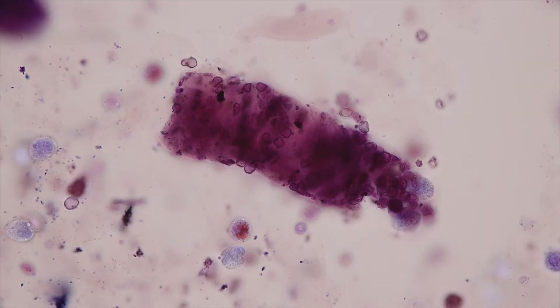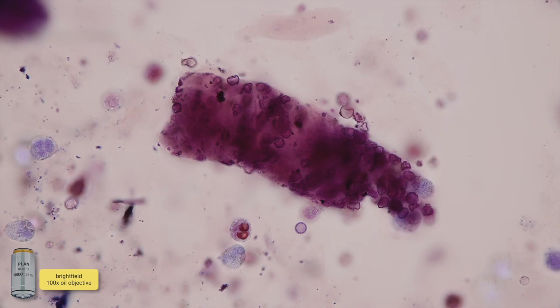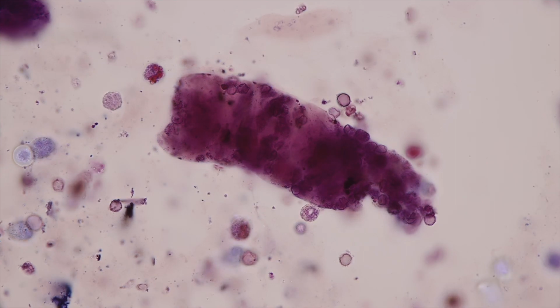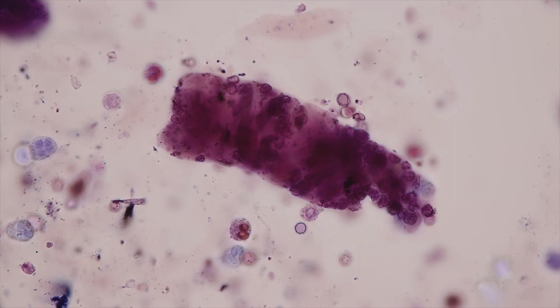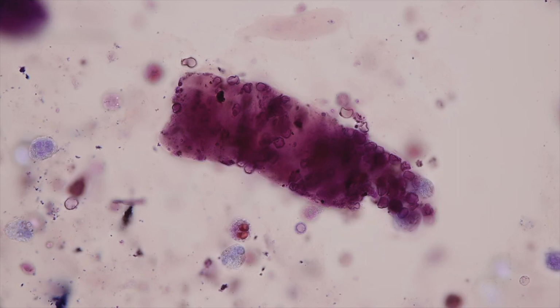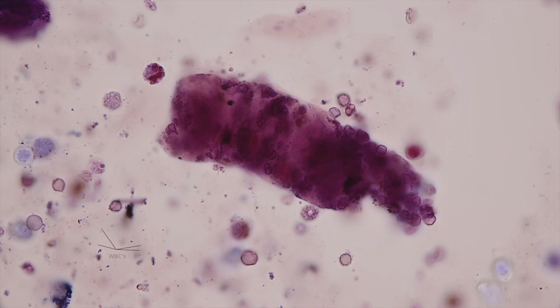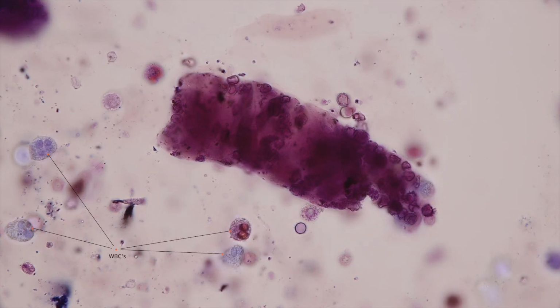Here on another area of the same slide, we come across a broad cast. It looks like it has a waxy character to it, but also contains a number of cells. We'll also notice several white blood cells. If you look closely, you can see the granular motility. These are glitter cells. The pale blue staining ones are very viable, the darker staining ones less so.